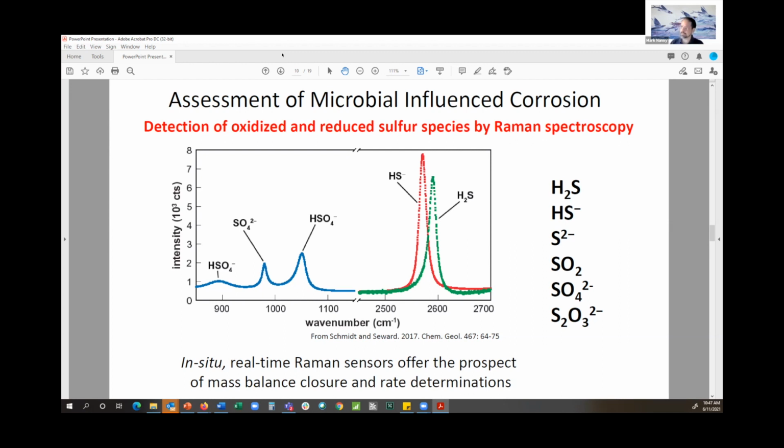But the challenges, as I mentioned earlier, are that people have used SERS to look at individual molecules on a substrate. But in many cases, that substrate and that molecule are in a very pristine environment of the laboratory. Interactions are optimized.